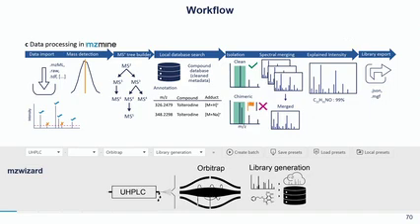So I will not go into each step here, so it really depends on your setup that you used. And then the only important step here is this local database search, because this is where we combine the metadata with our acquired data. So we have information on which compounds are in which injection, basically. So we injected, for example, position A1 from a well plate, and then we know in A1 we had, like, 10 compounds, and we would only search those in the specific file. And then from here we have the information about the compound.